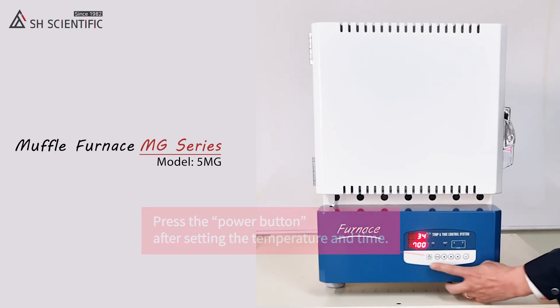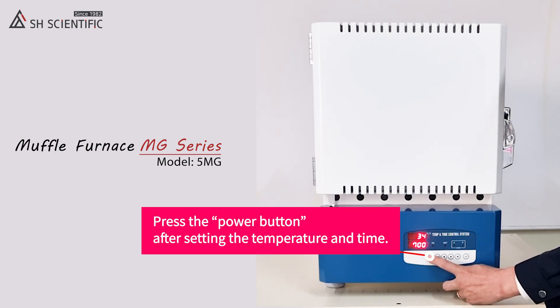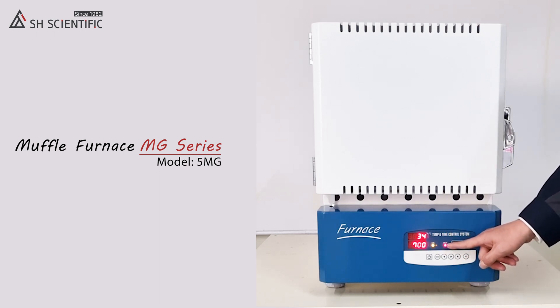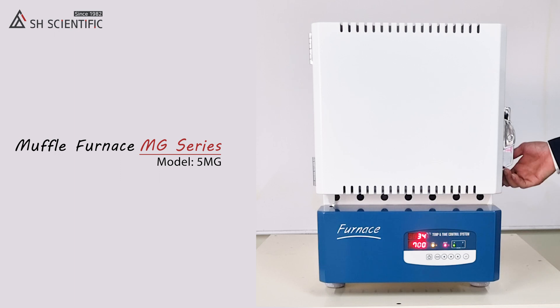When you're satisfied with the temperature and time settings, press the power button. You'll see that run, out one, and out two are all illuminated.